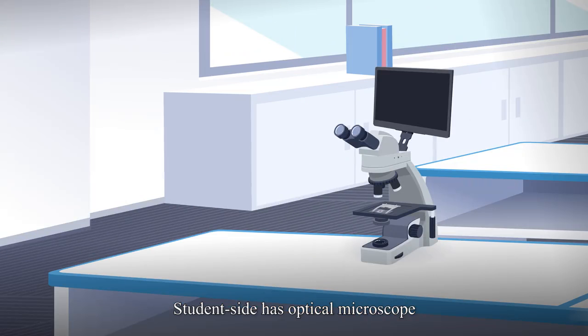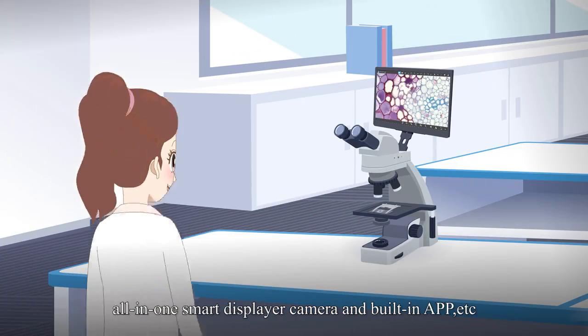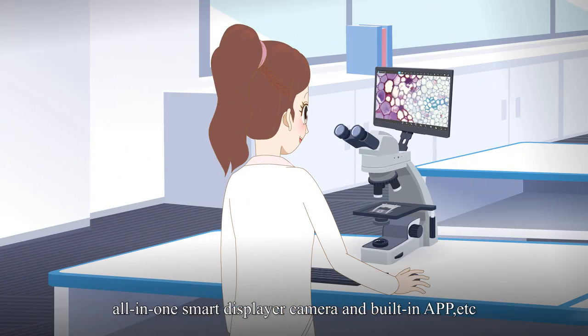StudentSide has optical microscope, all-in-one smart display or camera, and built-in APP.